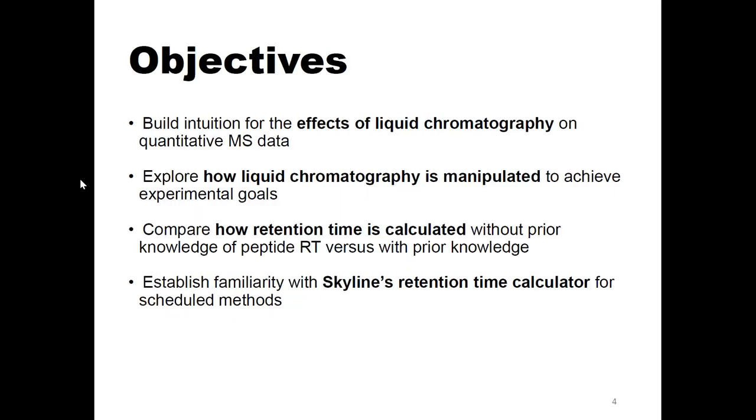Four main objectives for you here. There's going to be a lot of information, but these four take-home points, as long as they're clear, you're golden. The first, I want to help you build an intuition for the effect that liquid chromatography has on your mass spec data. I want to explore together how you can manipulate your liquid chromatography method if you're unfamiliar with that kind of method development. I'm going to explain to you a little bit more about how retention time is calculated based on just amino acid sequence or if you have empirical data.